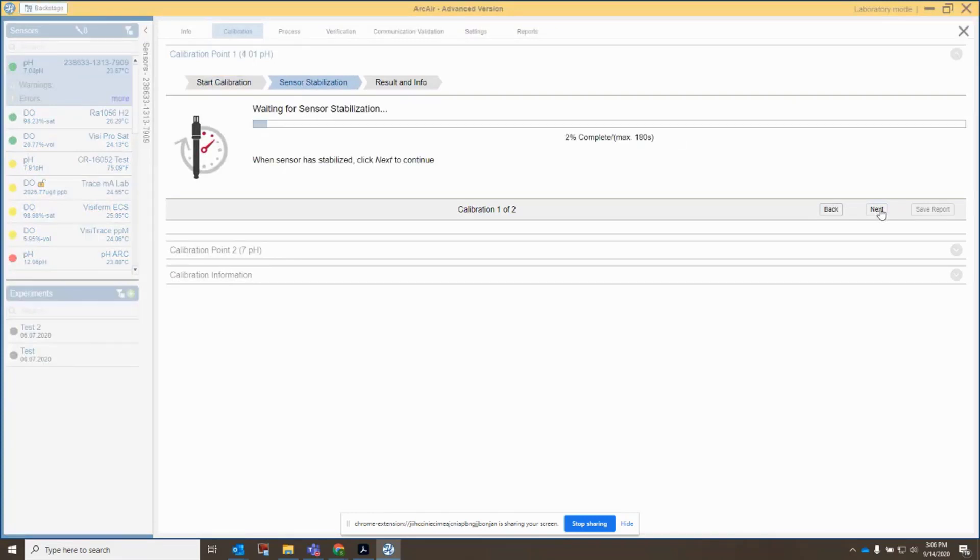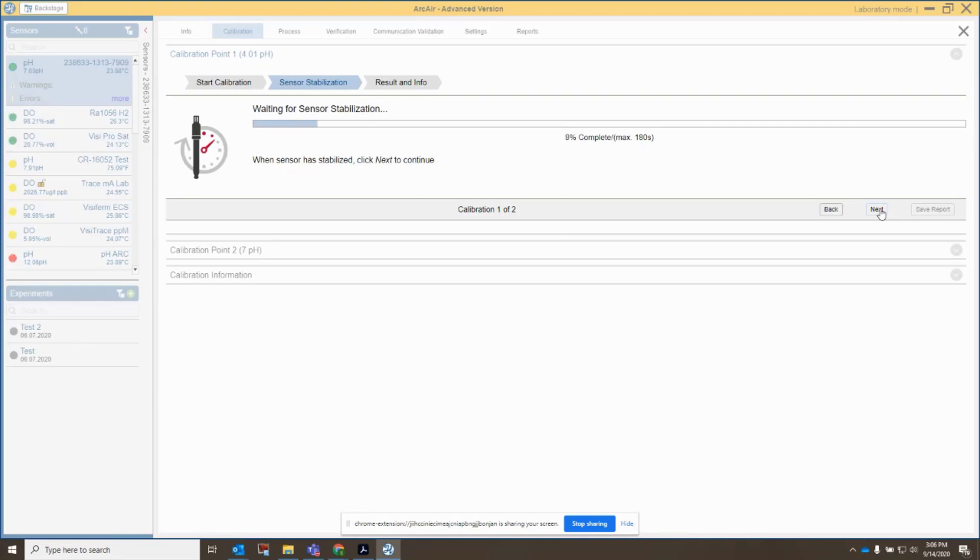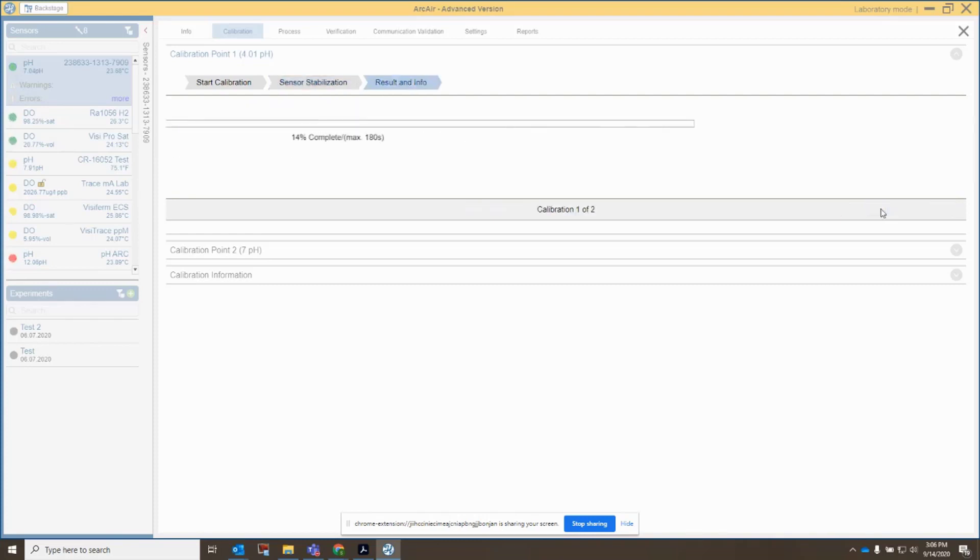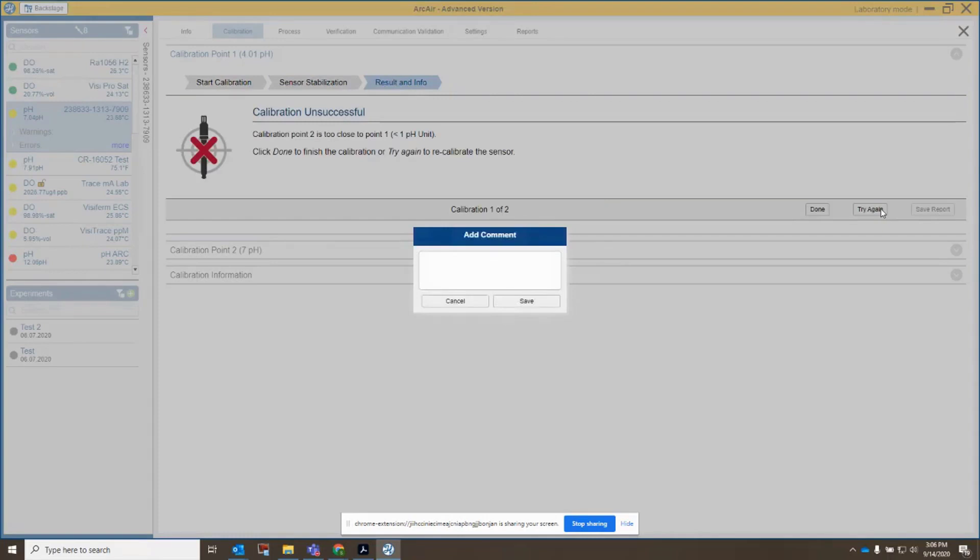And for the purposes of this video, I won't wait the full three minutes for sensor stabilization here. If your sensor value is moving around or the temperature is moving around, then you definitely want to wait for it to stabilize to get the proper calibration. But in this case, it's already sitting in 7 buffer, so it should be quite stable. So I'm going to click Next, and I get a note here.